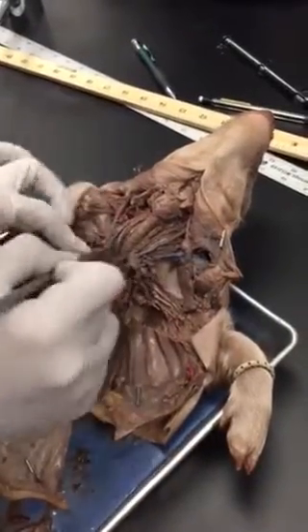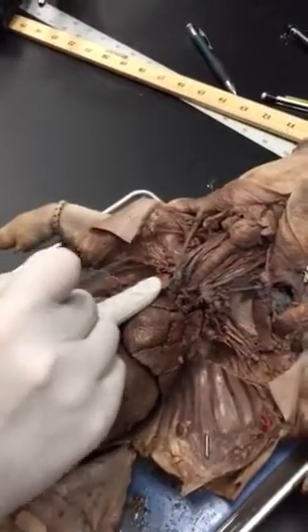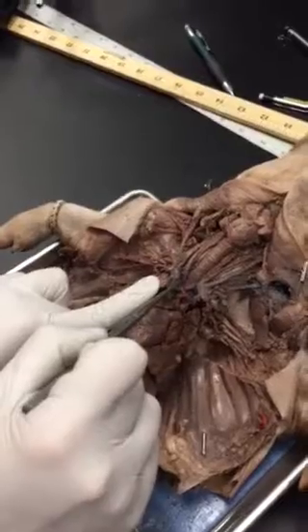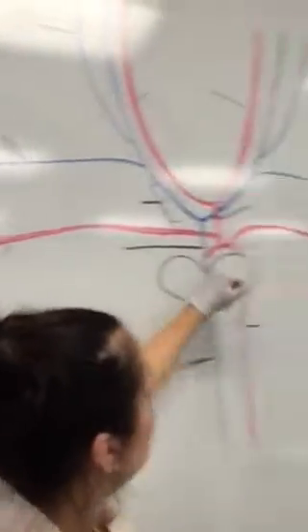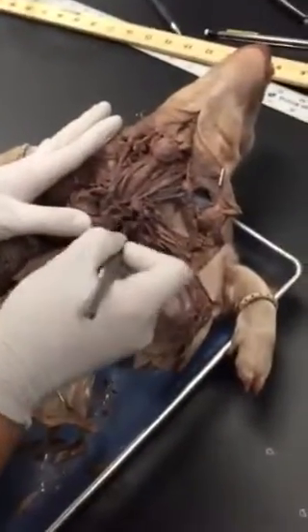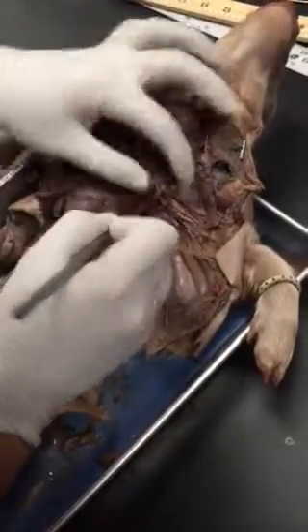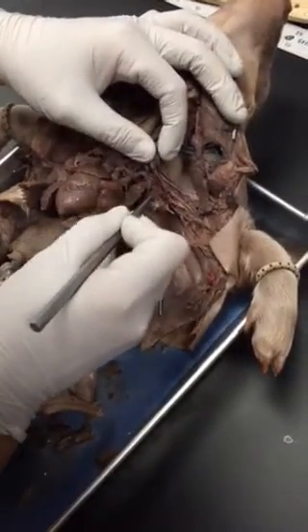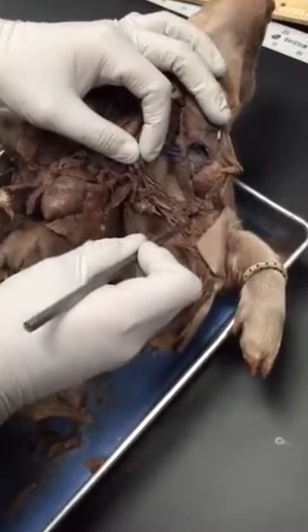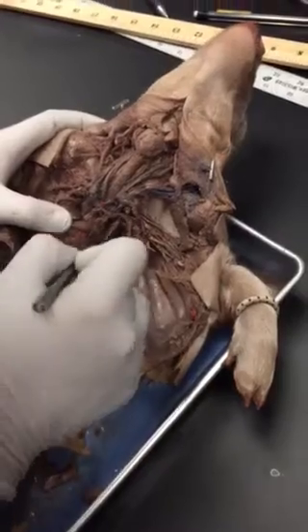And also, if we got behind here, we would see, you guys see this artery here? If you follow it, that's coming right off of this as well, okay? So that would be your subclavian artery, carotid trunk, carotid arteries, okay? All right, let's look at our second branch off of the aortic arch. So here's your aortic arch here, right? Here's your second branch. If you follow it here, you see it goes straight into the shoulder, right? You guys see that?